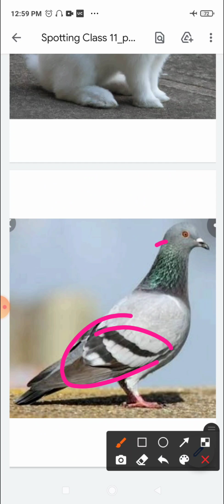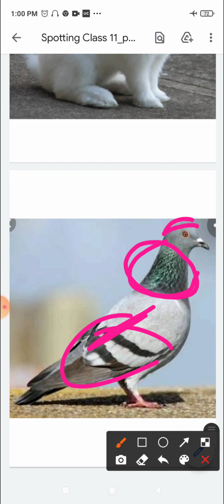If you look at this neck region, you can see how shiny, fluorescent greenish blue color is reflected. It has a subspherical head, a mobile neck, that means it can turn around its neck, a thick trunk, and a short tail.